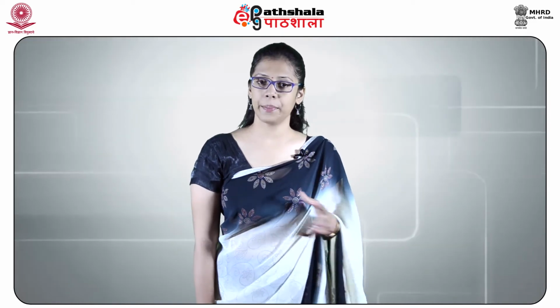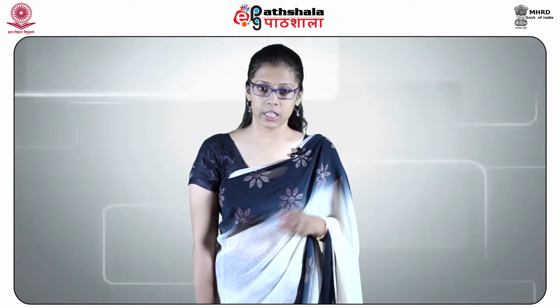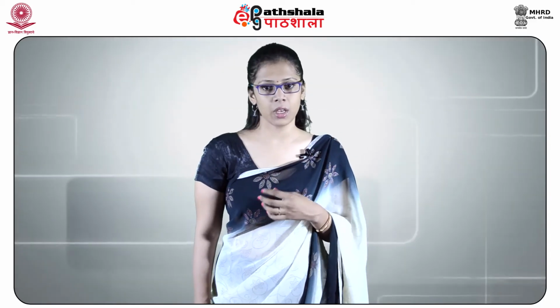The test tube should be subjected to ultrasonic oscillation, which can separate the spermatozoa from the dried stain, followed by microscopic examination. After fixing the same in dilute sulfuric acid, since spermatozoa contain gram-positive protein, the presence of spermatozoa will be confirmed by microscopic appearance of purple bodies.